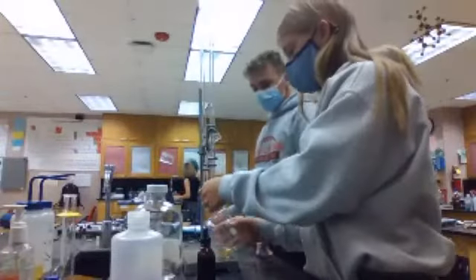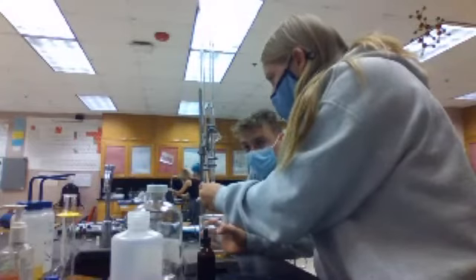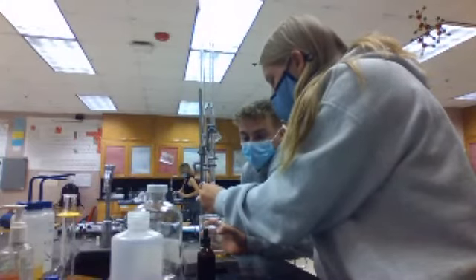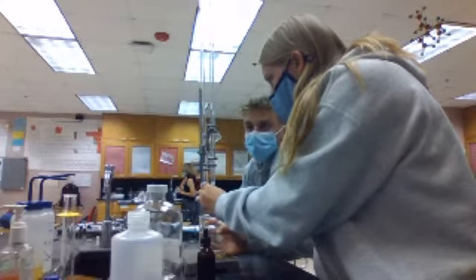Okay, number 7. And right now we're at 34 milliliters, so around 36.87. We should be seeing a color change, but that's just another milliliter. No, 15 milliliters. I don't know what we did wrong. We even put vinegar in here. We got 10 milliliters.